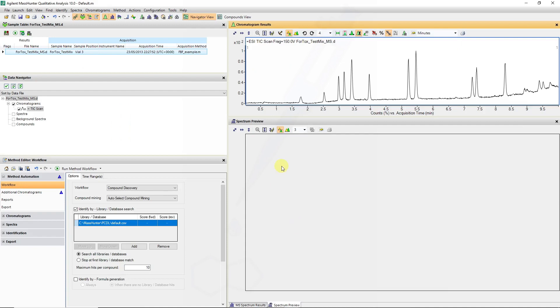I want to highlight what we saw in previous workflows, that we can run into isobaric species when running database queries, especially when dealing with large databases.